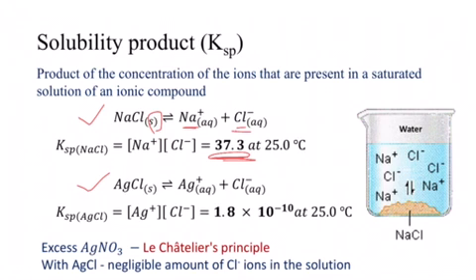On the other hand, some ionic compounds like silver chloride have a low solubility product. Therefore, most of the ions are in the form of precipitate. However, we still have free ions in such solutions. So, excess amount of precipitating agent, here silver nitrate, is added.